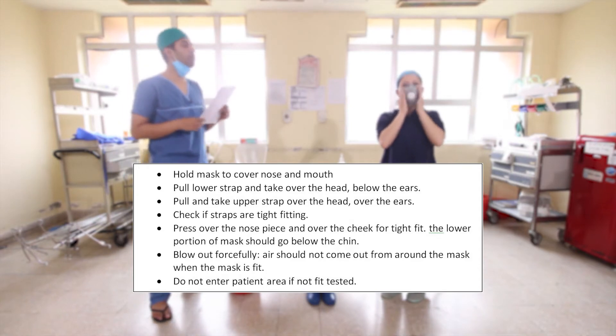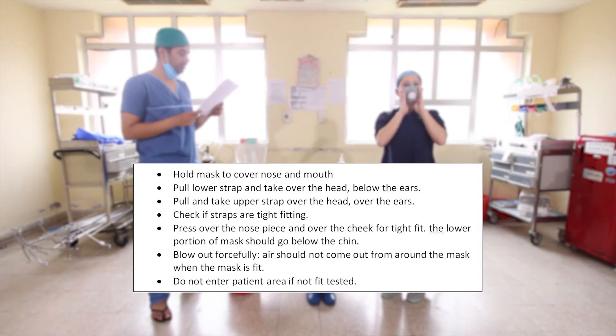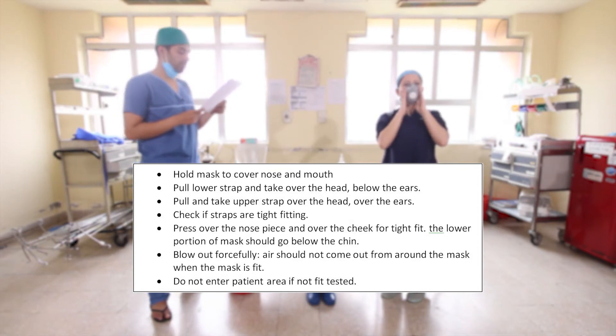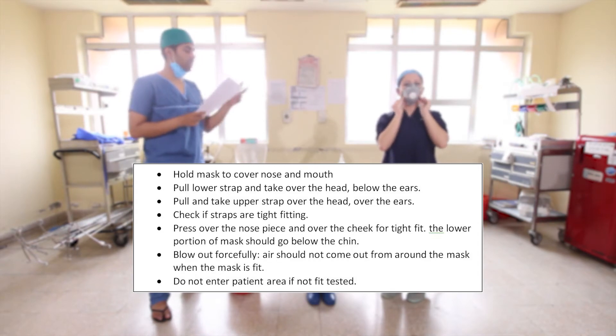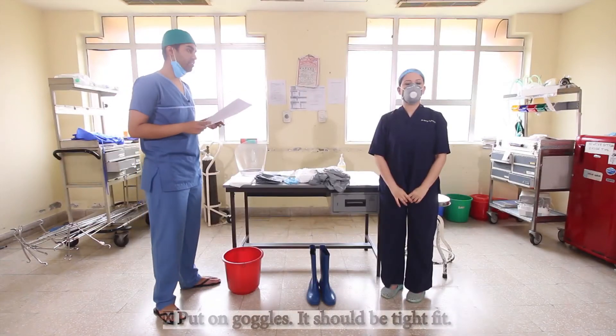The lower portion of the mask should go below the chin. Blow out air forcefully — air should not come out from the mask or its outer limits. Do not enter the patient area if it does not fit properly.